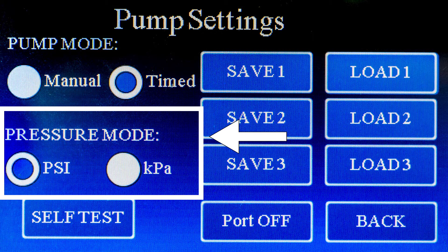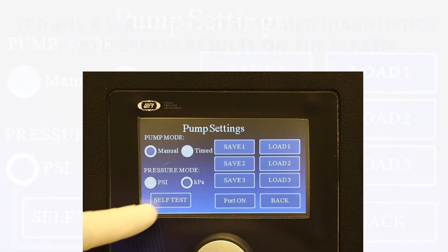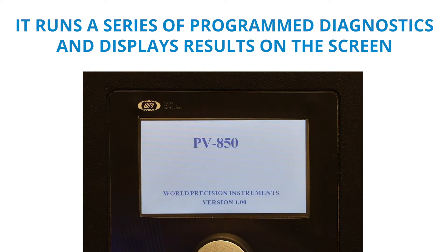you can select one of the checkboxes to set the display to either PSI or kilopascals. The self-test runs whenever the unit is powered on. To initiate a test manually, press this button. It runs a series of program diagnostics and displays results on the screen.